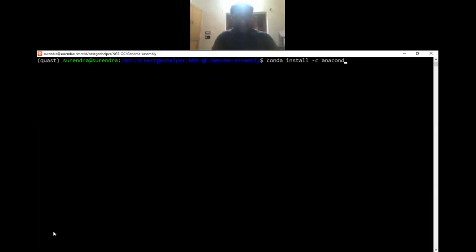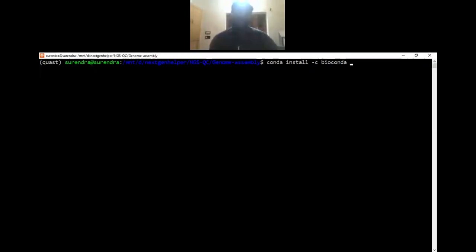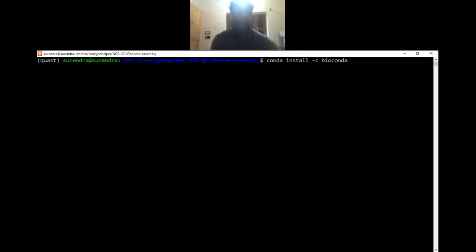Excuse me, sir. Yes. Sir, is there any way to learn more about this SPAdes system? About what? This is SPAdes. Yes, sir, SPAdes. You can go through the manual which is available from the SPAdes website. And you can also go through the literature, the papers the developers have published. Okay.